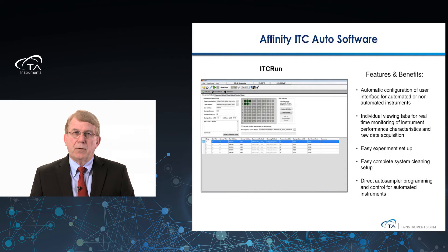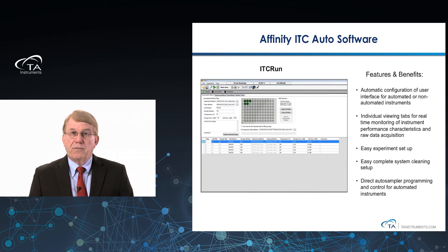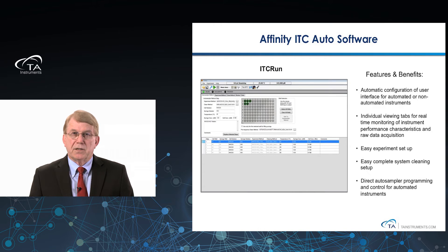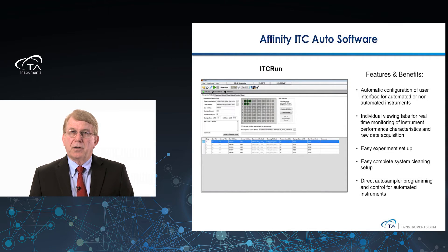The Affinity ITC Auto software is an advancement in thinking about how you set up the experiment. ITC Run is the data acquisition and instrument control software you'll see when you start up the instrument. It has automatic configuration so that whether you're using a standalone or automated instrument, it will automatically configure the interface. We use individual viewing tabs so you can look at experimental setup, monitor instrument performance, and see data in real time. Easy experimental setup, easy complete system cleaning setup — all done in a central, easy-to-use user interface.